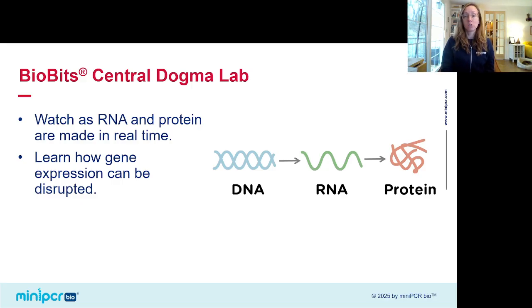In this lab, students will watch as RNA and protein are made in real time. So they will watch the processes of the Central Dogma as they take place. They'll also learn how gene expression can be disrupted.